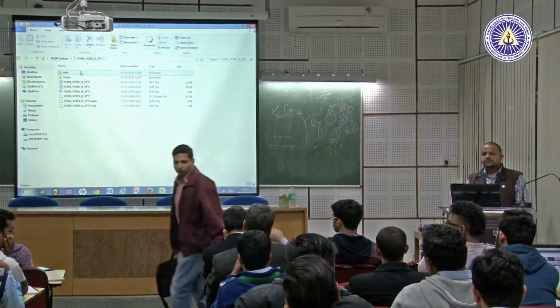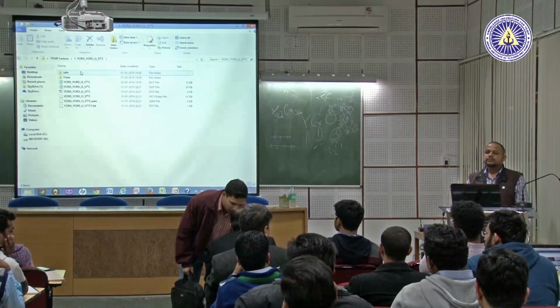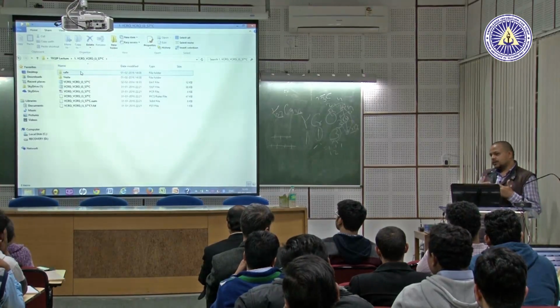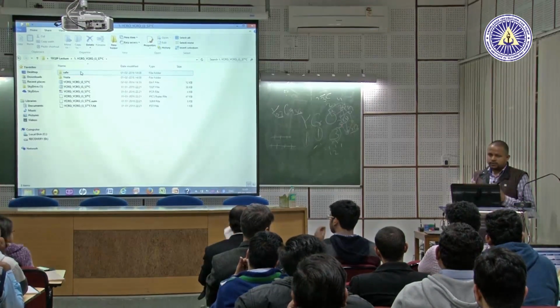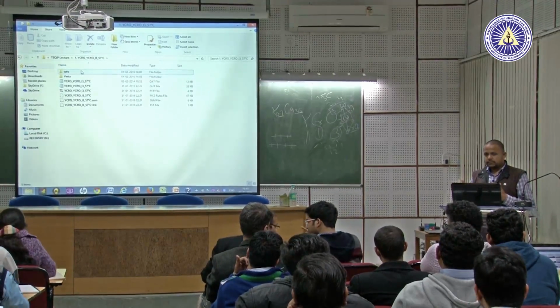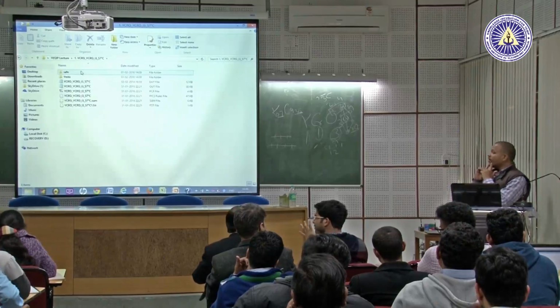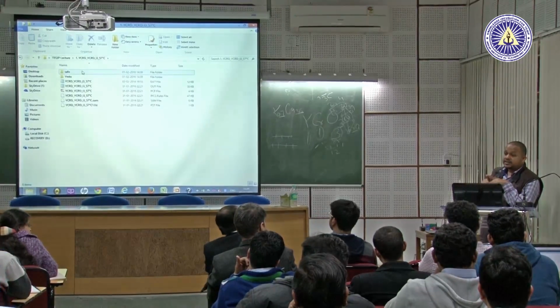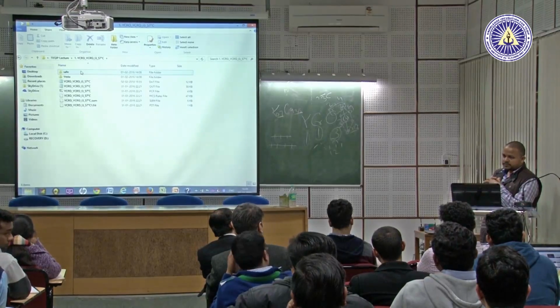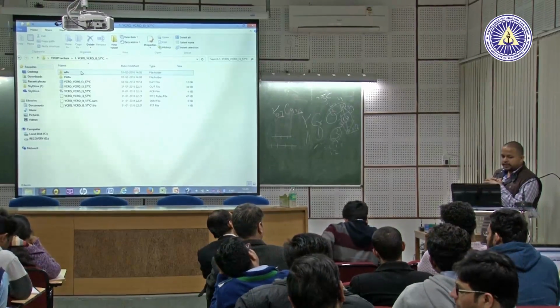We can use FullProf only after taking the assurance that your material is pure, or you can do it also for impure. I would like to mention here, you can use FullProf simultaneously for 16 phases, or one by one.